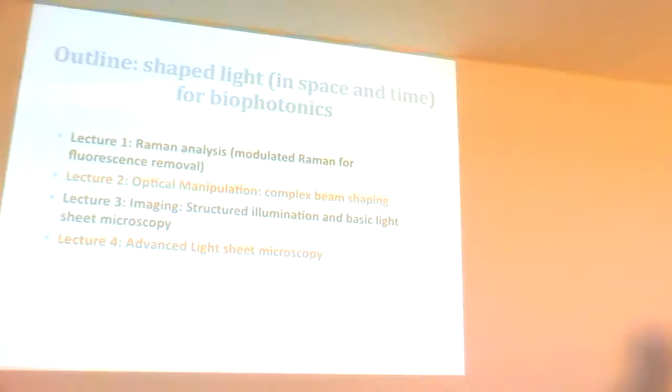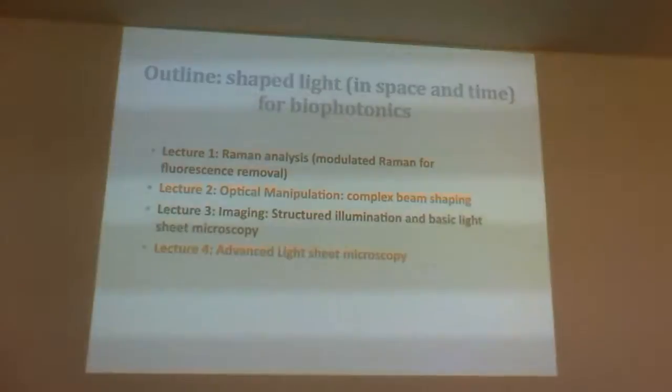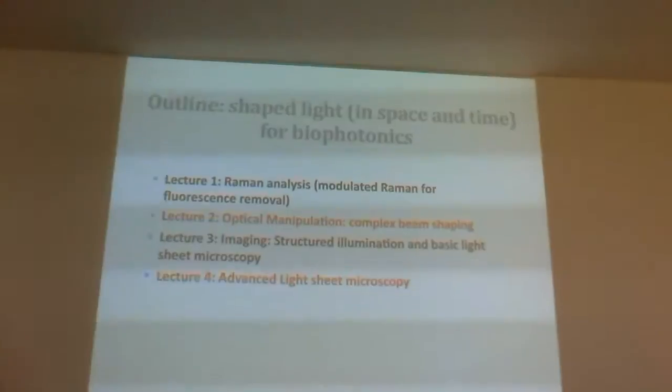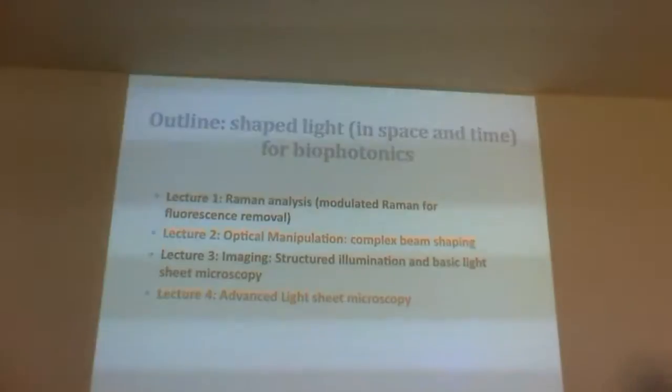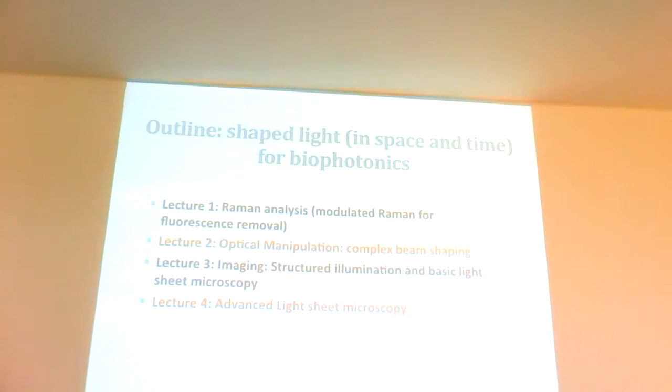And so you may have spatial constraints, temporal constraints, you may have issues with photobleaching. So in my view, the right way to approach the problem is to ask yourself, what is the question I need to answer and what resolution do I need? There's no point in getting a system that gets you 10 nanometer resolution if 100 nanometers will suffice. If your fluorophore photobleaches very quickly, if you don't have the right laser, what depth do you need? So you need to formulate a question and then think of the science to answer it.